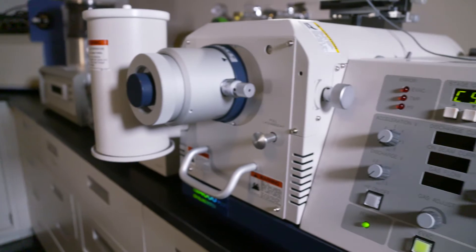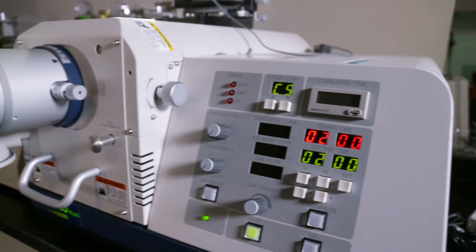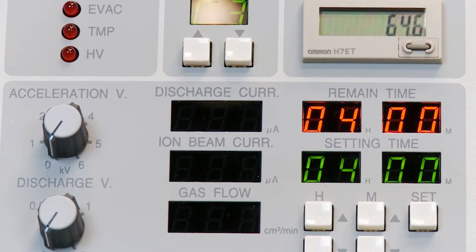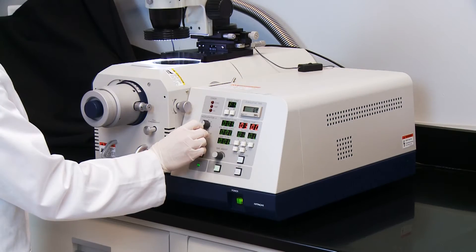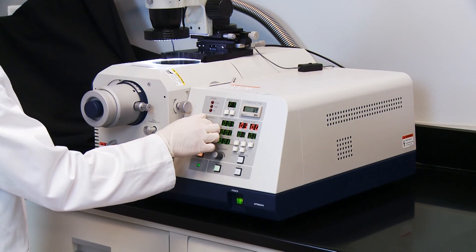The Ion 4000 Plus includes a user-friendly electronic control panel which contains all the functions needed for a successful milling session. Controls are provided to adjust the Ion Beam accelerating voltage and beam current.